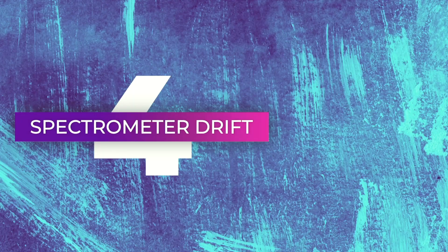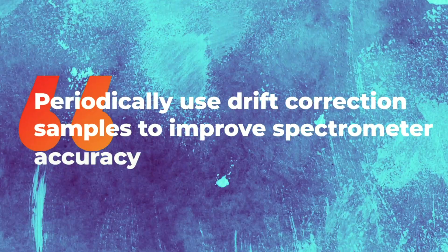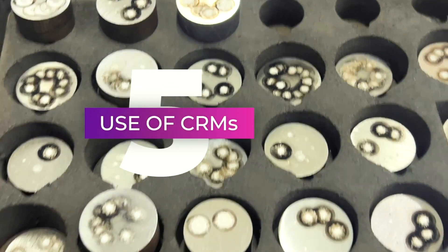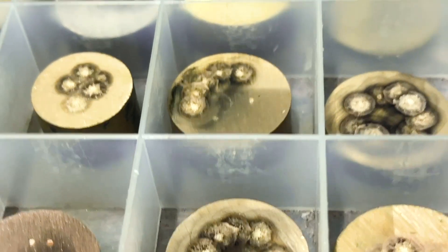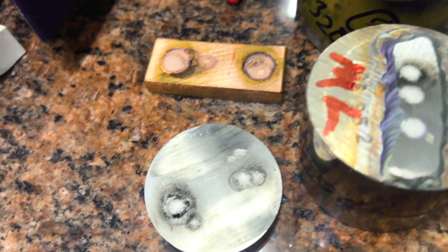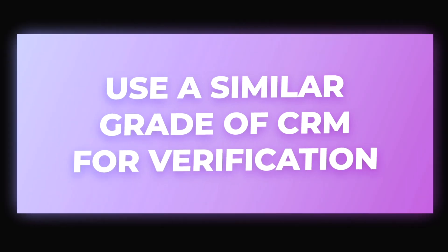Over time, the electronics and the detectors inside the spectrometer start to drift. Periodically, use drift correction samples to maintain accuracy. Point number five: use a certified reference material, also called a CRM, to check for the accuracy of the spectrometer. Use a similar grade CRM for verification — for example, do not use a low alloy CRM to check if your results of a stainless steel are acceptable.